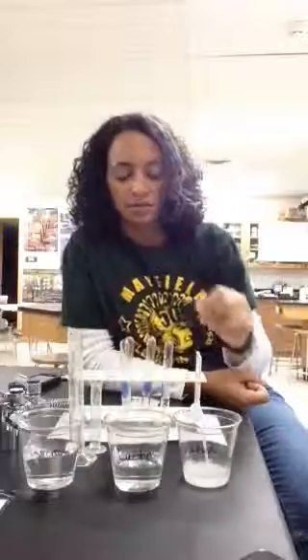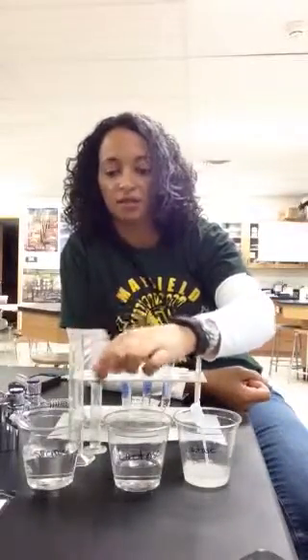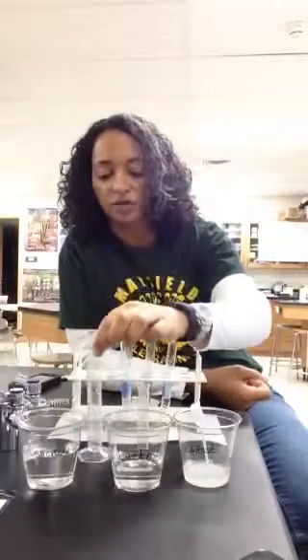So when you get to your lab station, you're going to notice you have your three solutions. You also have a test tube rack with 4 test tubes, and you have 2 graduated cylinders, a small graduated cylinder and a large one.